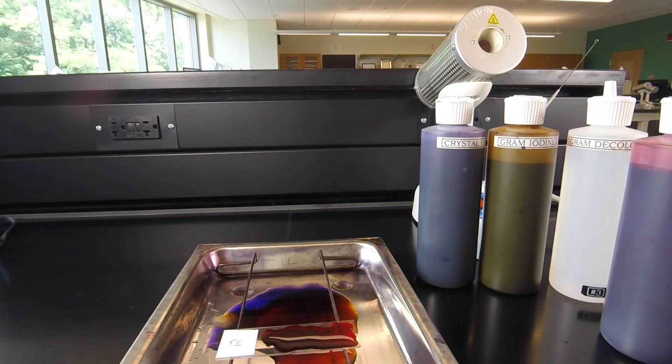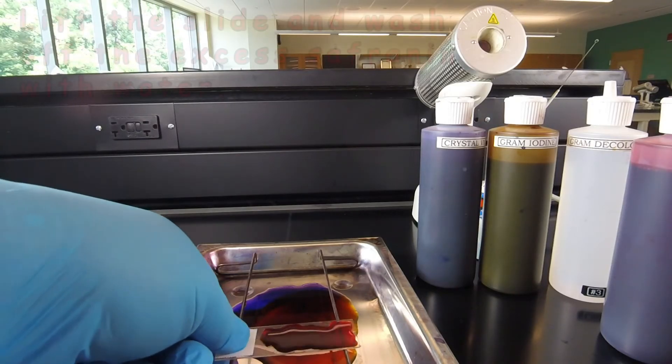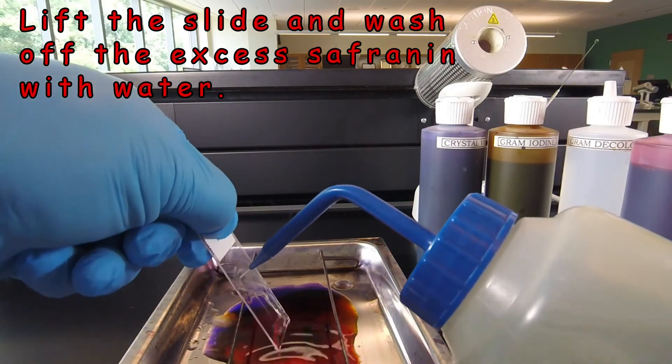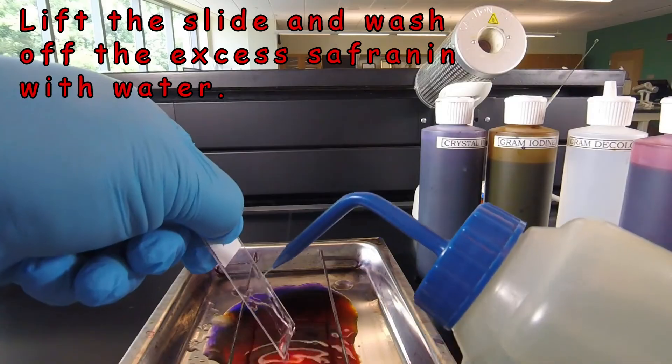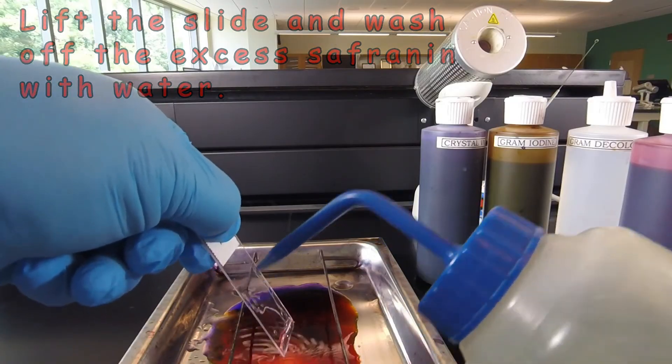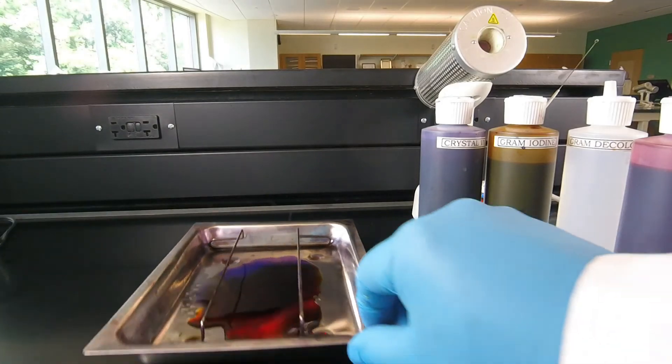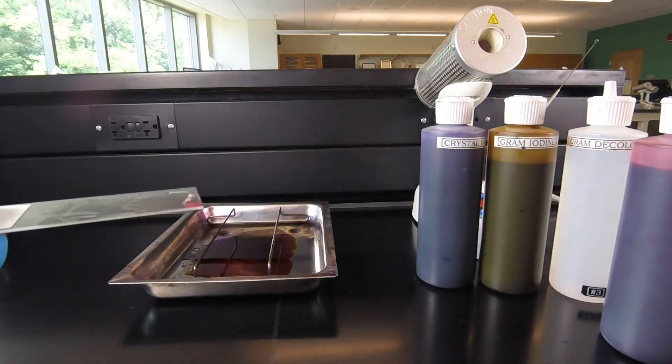Now that one minute's gone by, we're ready to wash off the excess Safranin from our slide. We pick the slide up, direct the water above the smear, watch the bottom of the slide for the red Safranin coming off. When that looks relatively clear, shake off the excess water, and at that point, we're ready to blot the slide.